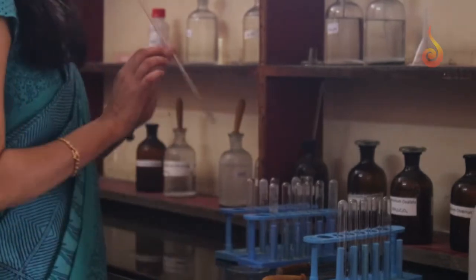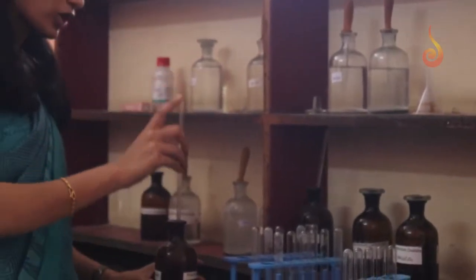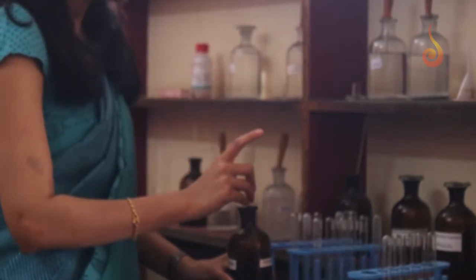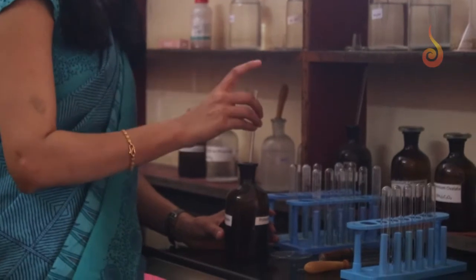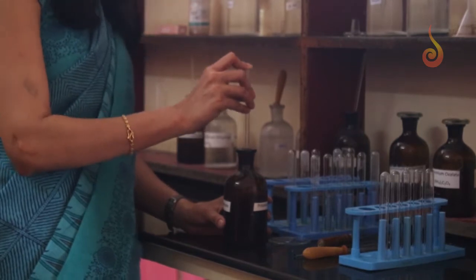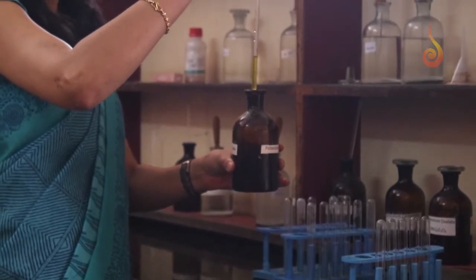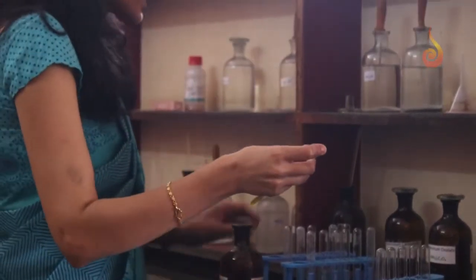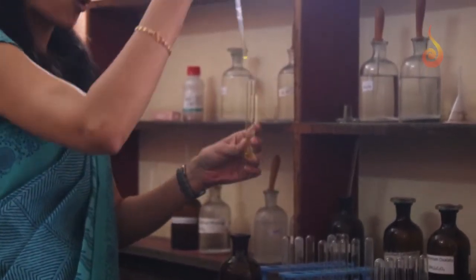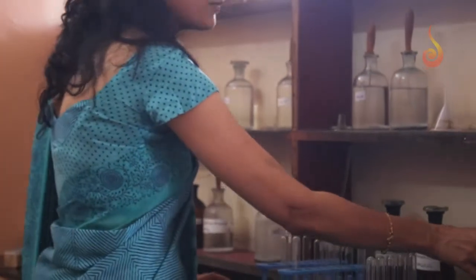Then last but not least, the glass tube. Why is it used? Because to take the reagent from the reagent bottles, we always use a glass tube. How to use a glass tube? We have to place it in the bottle, close the mouth of the tube using the forefinger, and then remove it. Now when you look at the glass tube, we will observe solution in it, and then we have to leave the solution into a test tube by releasing the forefinger. This is how glass tubes are used. So these are the main important apparatus.